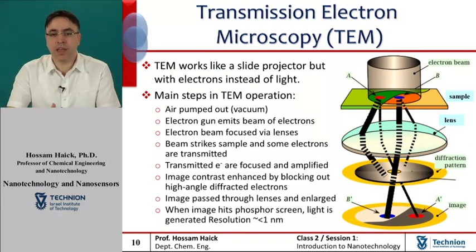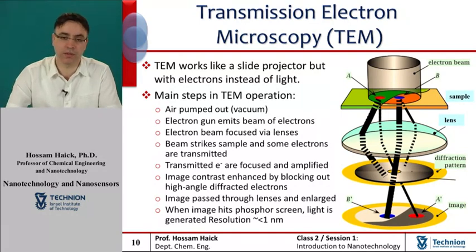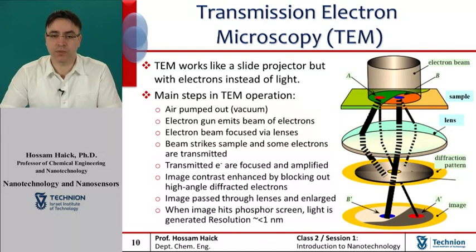The ability to determine the positions of the atoms within materials has made the HRTEM an important tool for nanotechnology research and development. Still, there are a number of drawbacks to the TEM technique. Many materials require extensive sample preparation to produce a sample thin enough to be electron transparent, which makes the TEM analysis a relatively time-consuming process with a low throughput of samples. The structure of the sample may also be changed during the preparation process.